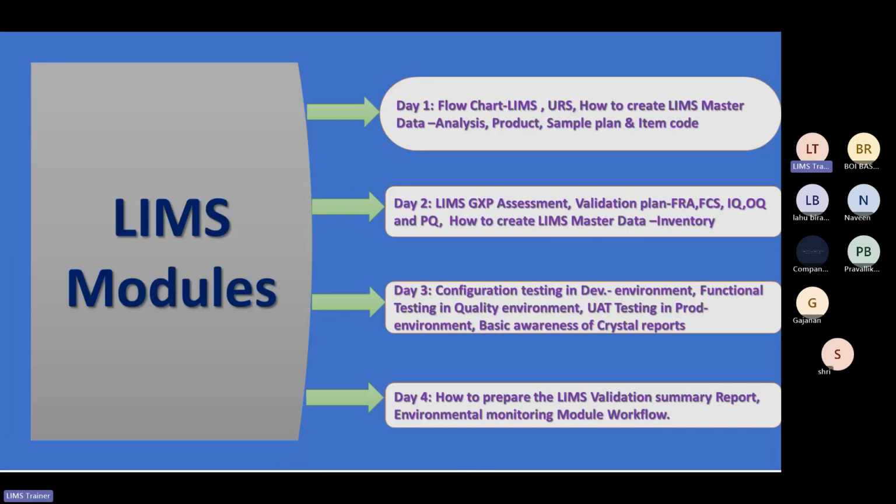Now see how we are going to take the course. See the flow chart, the different flow charts involved in LIMS, then the user requirements, how to create master data.